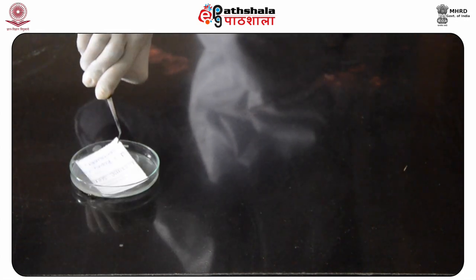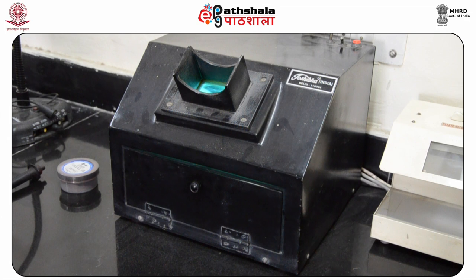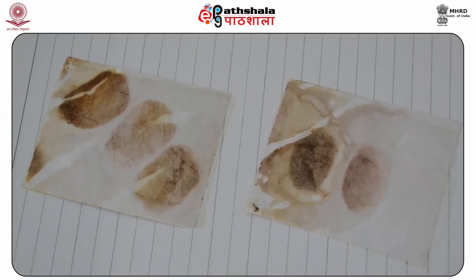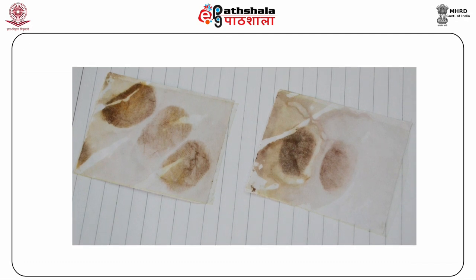Take it out and drain off the extra solution and let it dry in sunlight or UV light. Here you can see that the prints darken on being exposed to sunlight or UV light. Photograph the developed prints.